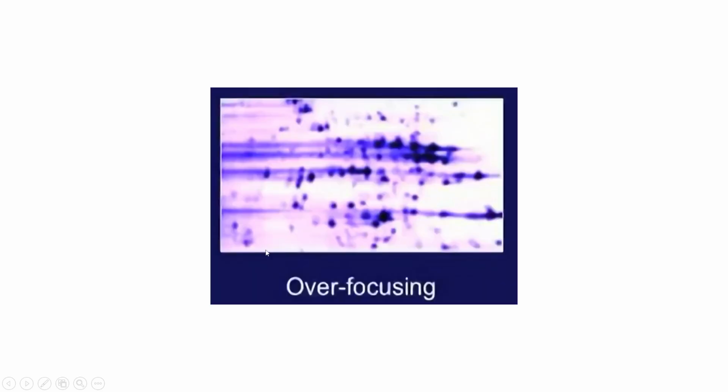Still, this is a good image, though there is some spreading you can see here. The destaining might not be done properly. If you are trying to over focus, then also certain kinds of gels can be seen.